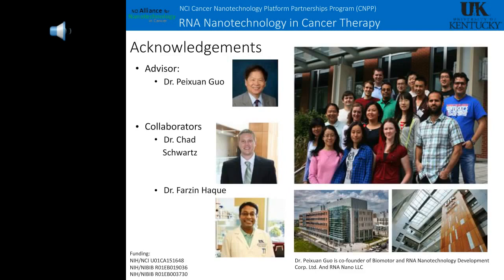Perfect. Thanks again. One more question is, what is the purity of the RNA that you can reach using ultracentrifugation? And are there any deleterious effects of cesium chloride after purifying using this method?